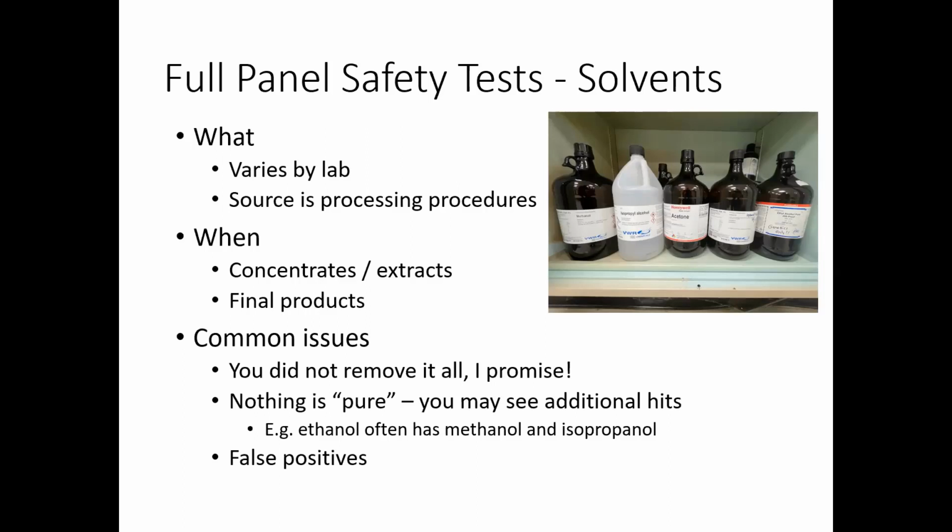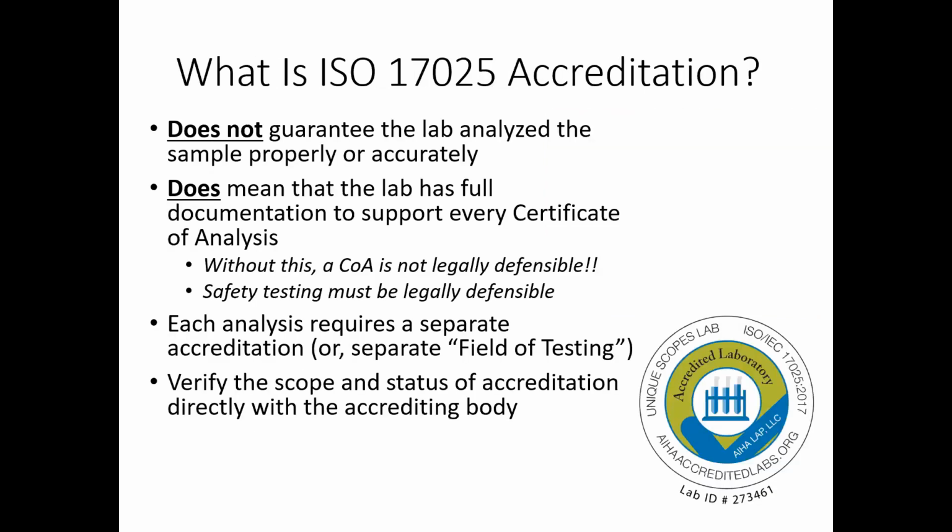Labs should really be testing just the lab air before your sample and after it. That way, if something pops up in your sample, you can say, no, it was clean before, it's clean after, so this is a real result for your sample. And if there's ever a question, you should be able to ask your lab, show me your quality controls, show me the blanks on both sides. This one is from the lab side. This one is a little difficult, and we're testing down to the parts per billion. So if you can smell something in the air, the instrument can read it.